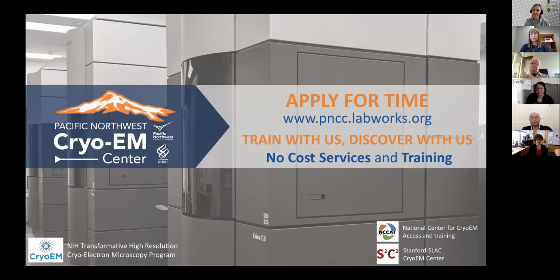For sample preparation, we have a Vitrobot, a Leica GP2, and a VitraJet, which is unfortunately still undergoing validation before being offered to users. We can once again have visitors on site starting in March, and we're planning to start our in-person workshops in April, beginning with our sample preparation workshop, followed by our microscope operation workshop in the summer. Look for more information on those workshops on our website and apply today.